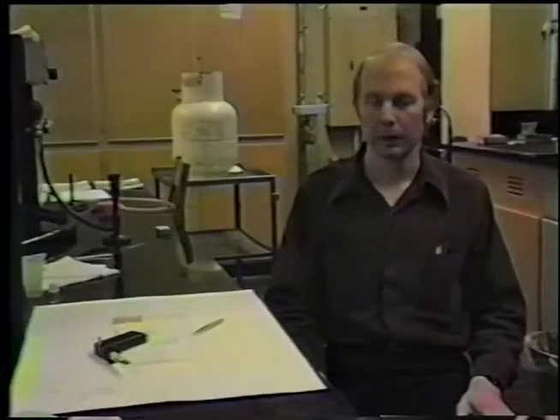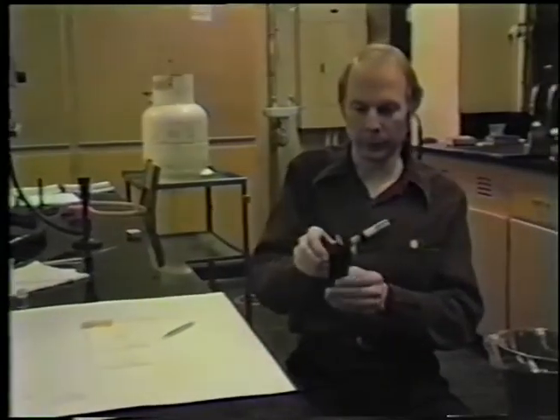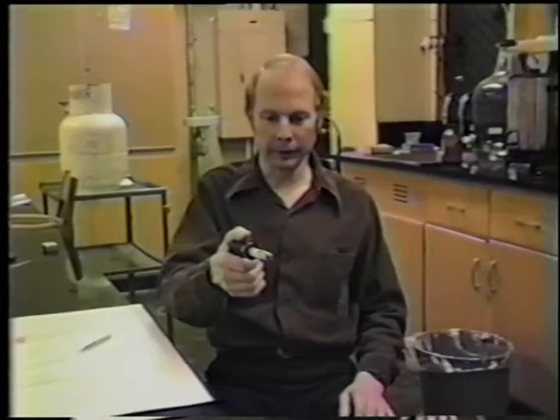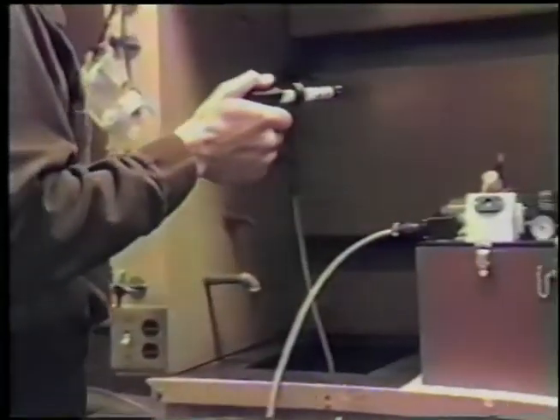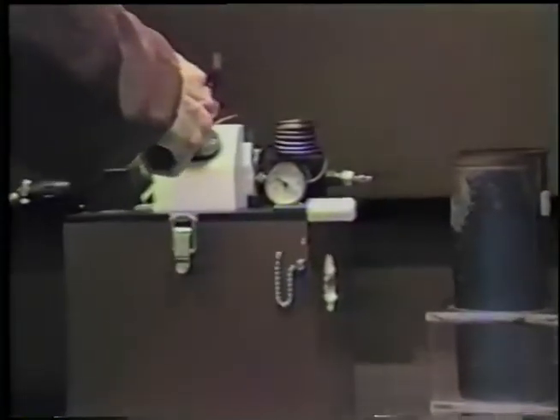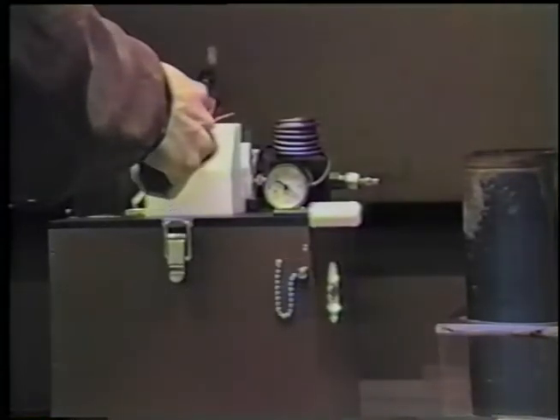To freeze the sample, the operator picks up the sample holder and holds it like a pistol, with his thumb resting lightly on the thumb lever. Carry the sample over to the jet freezer and insert it into the sample port. The sample is now frozen.